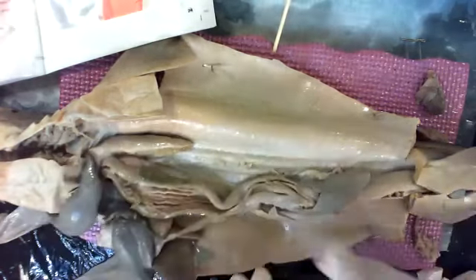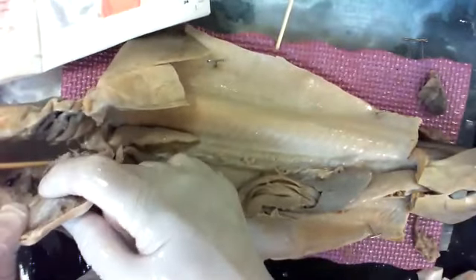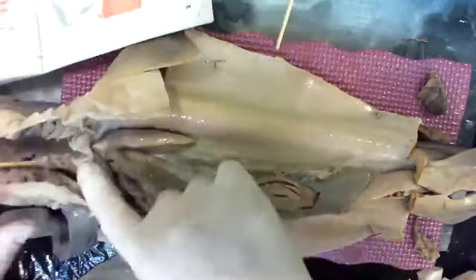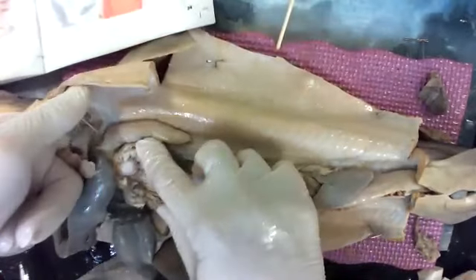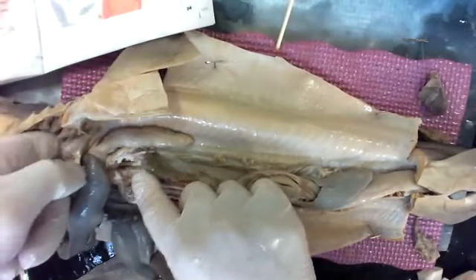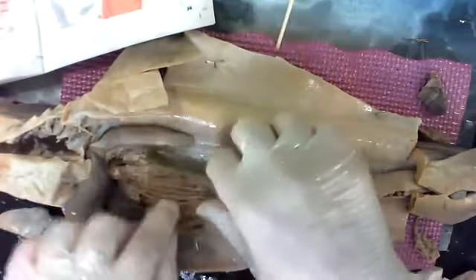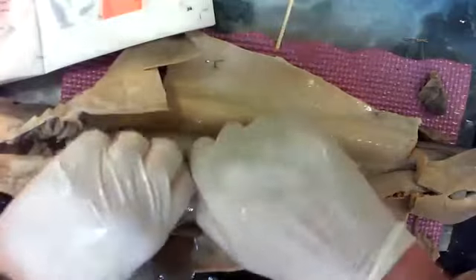Okay, so there's the pathway. Food comes in, gets smashed by this cartilage tongue. Food's tasted on the roof of the mouth, goes into the esophagus, this way, traps the food so it doesn't go back unless it's intentionally pushed back. The esophagus has papilla, fingers. Food goes down into the stomach. The rugae stretch, wrap around the food and smash it because it's muscle.